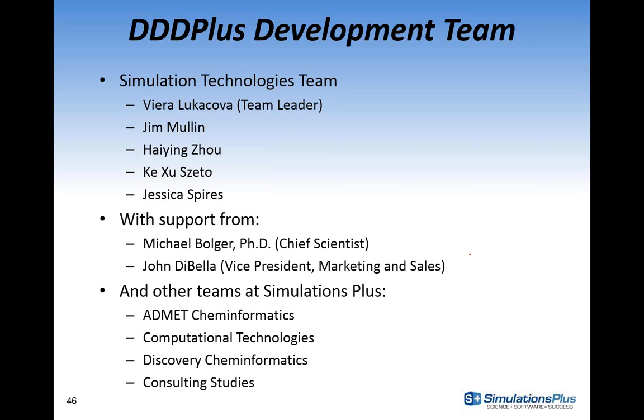Not currently. Right now, the models built into the IVIVC that allow you to create the correlation between your in vitro and in vivo are limited to linear, power function, and polynomial functions, quadratic and cubic equations. The cubic equation does, in some cases, approximate the sigmoidal shape, so it would allow creating an initial lag time, but a sigmoidal model is not directly implemented as a correlation equation.